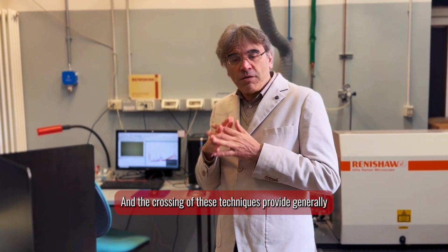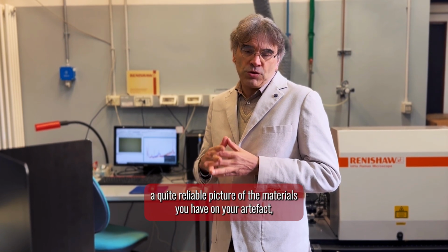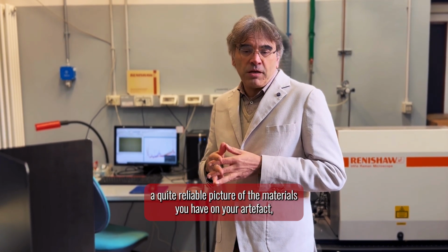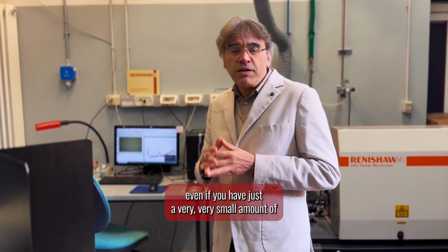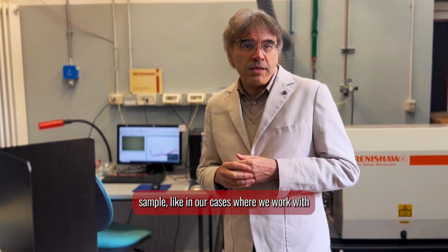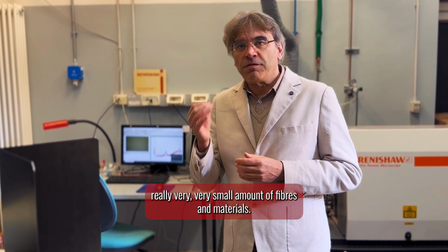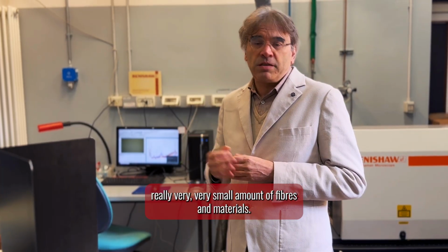The crossing of these techniques generally provides quite a reliable picture of the materials you have on your artifact, even if you have just a very, very small amount of sample, like in our cases where we worked with really very, very small amounts of fibers and materials.